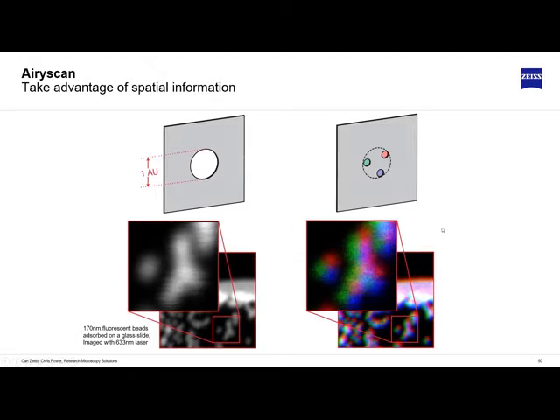This is the image you would get. Now, if you look at the bead pattern on the bottom, coming from the UK, I always think this looks like the UK and Ireland here. If you look at the island of Ireland over here, on the image on the right, you see 3 islands. Now, of course, there is only one island of Ireland, there is only one bead here, but by moving the pinhole, you see that from slightly different angles.